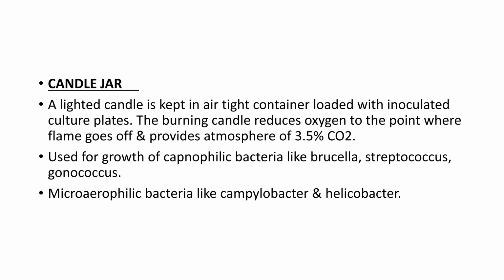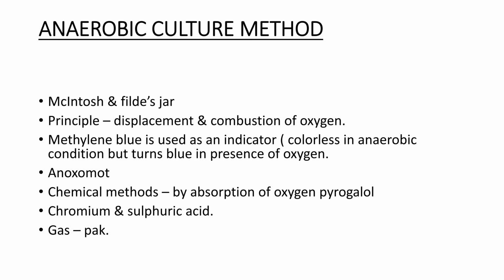It is used for the growth of capnophilic bacteria, that is the carbon dioxide loving, like Brucella, Streptococcus and Gonococcus, and microaerophilic bacteria like Campylobacter and Helicobacter. The other method for anaerobic culture is the McIntosh and Fildes jar. The principle is the displacement and the combustion of oxygen. Methylene blue is used as an indicator; it is colorless in anaerobic condition but turns blue in the presence of oxygen. So it acts as an indicator.